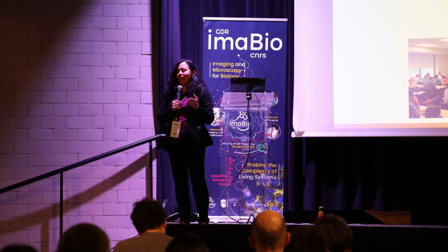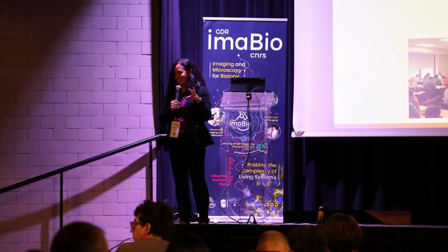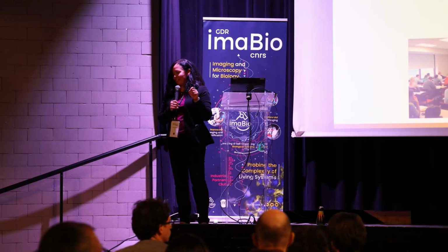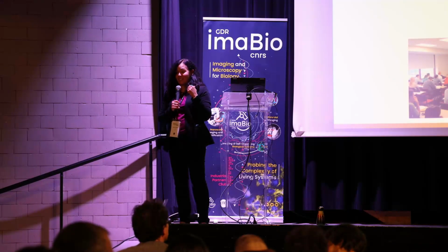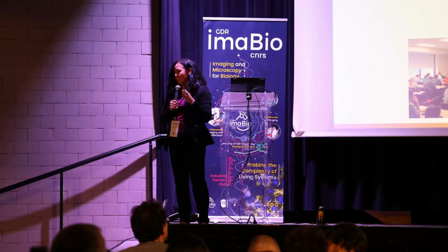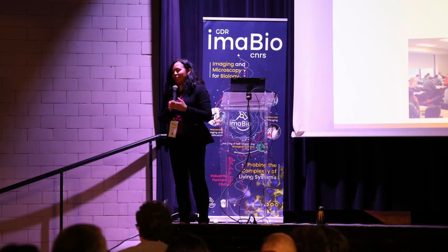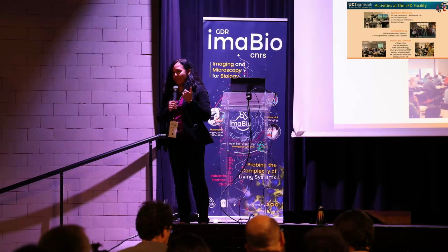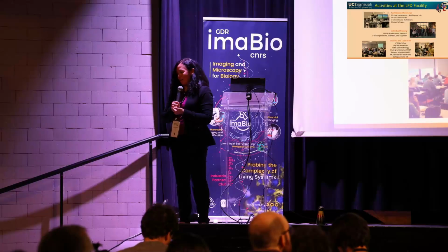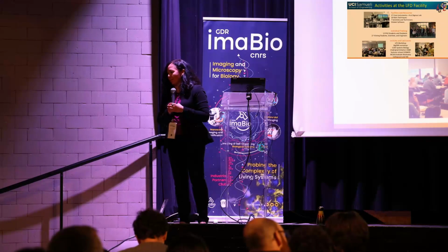So what is really happening is that the reactive oxygen species is changing the lipid states, and that's the signature that is coming up. In the embryos, this happens, it has to happen. Reactive oxygen species is a normal production during development. And so we confirmed that this was due to oxidized lipids using third harmonic imaging and looking at CARS imaging.